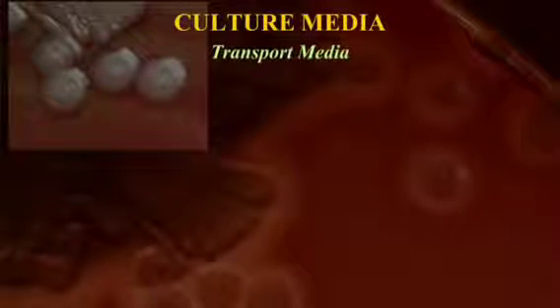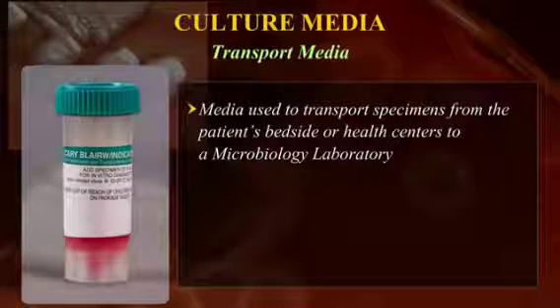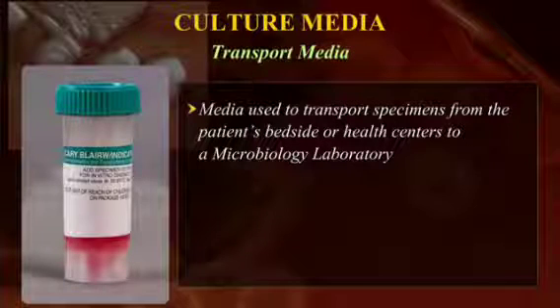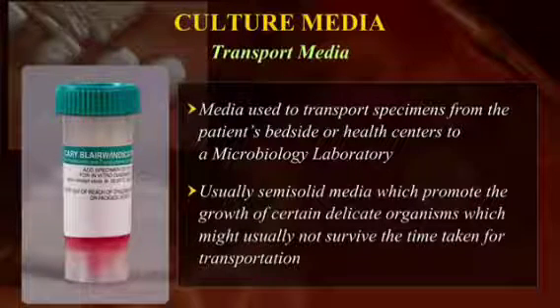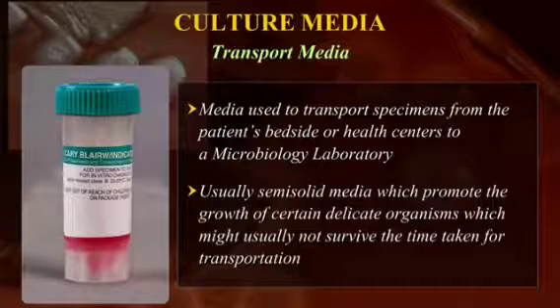Transport media. As the name indicates, these media are used to transport specimens from the patient's bedside or health centers to a microbiology laboratory. These are usually semi-solid media which promote the growth of certain delicate organisms which might usually not survive the time taken for transportation of the specimen to the laboratory.